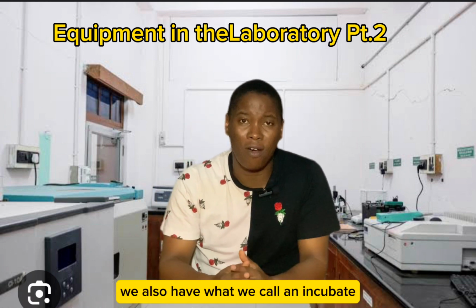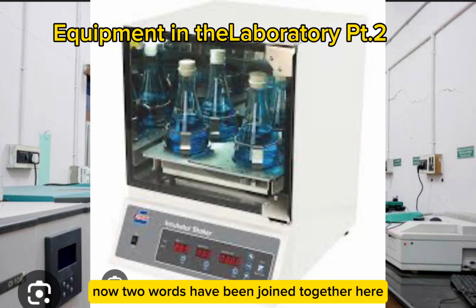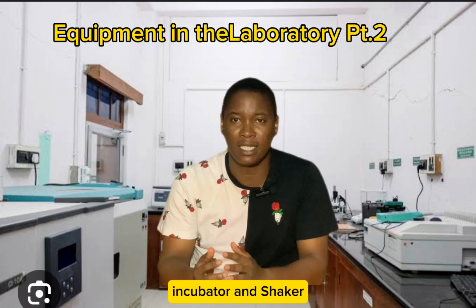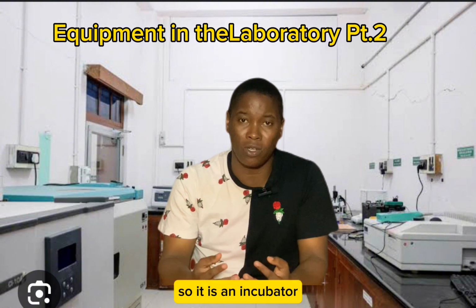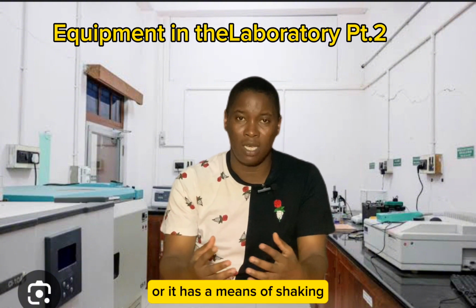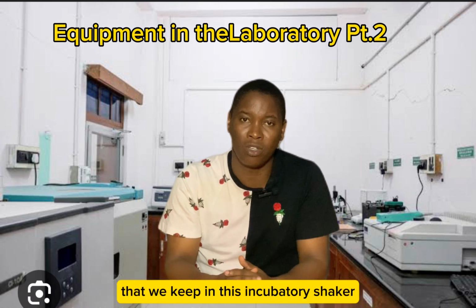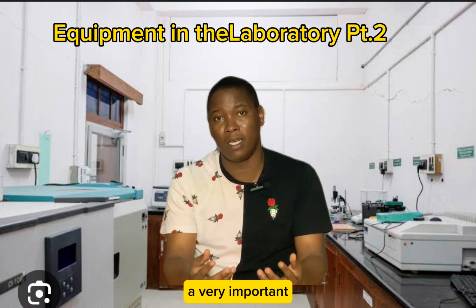Now we also have what we call an incubatory shaker. Two words have been joined together here, incubator and shaker. So it is an incubator, first of all, but within the incubator, it has a tray, or a means of shaking whatever sample that we keep in this incubatory shaker. Now, this is very important.